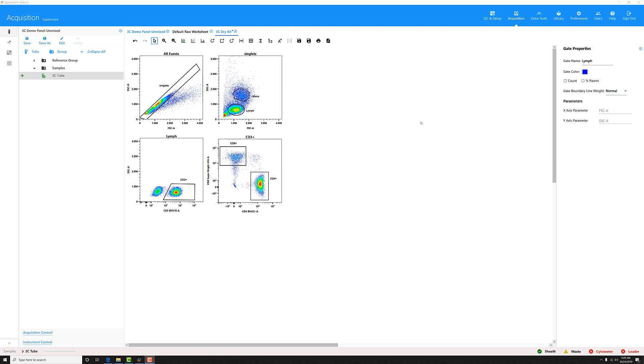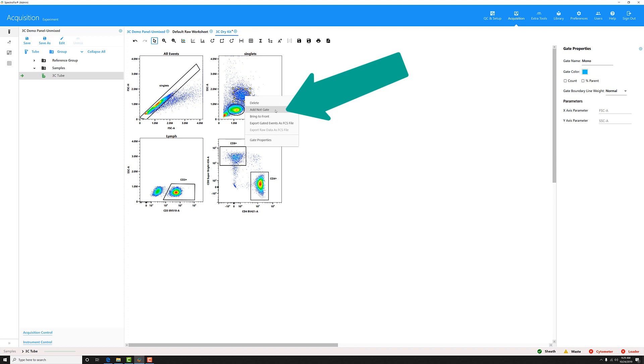To get to the NOT gate, simply click the gate that you want to create a NOT gate off of. For example, I could click this MONO gate and right click on it, then choose the ADD NOT gate button, and a NOT gate will be created.